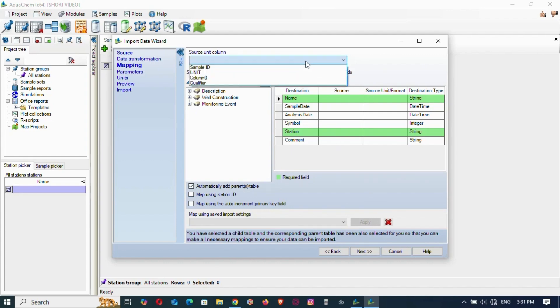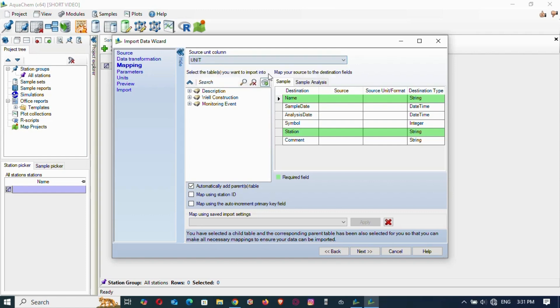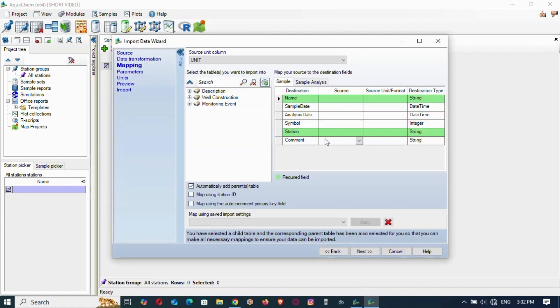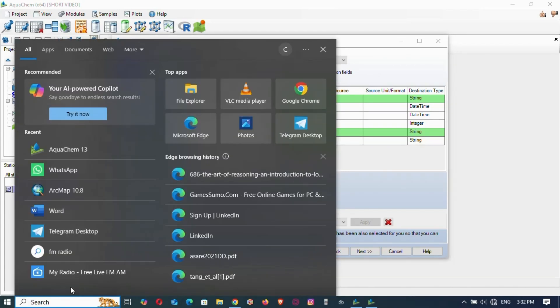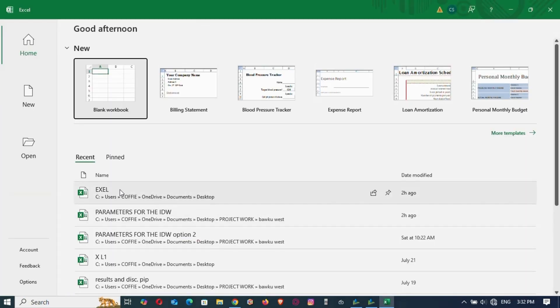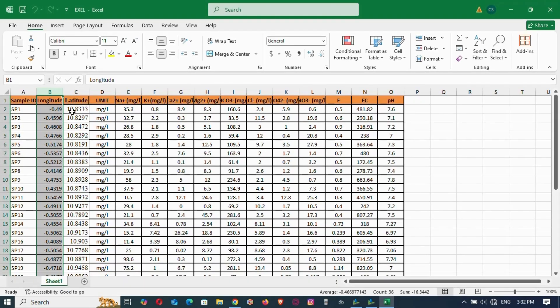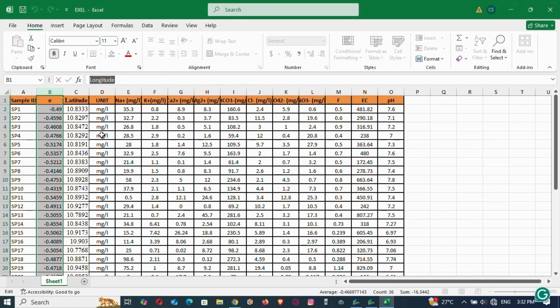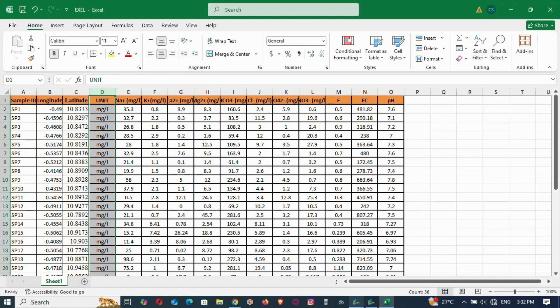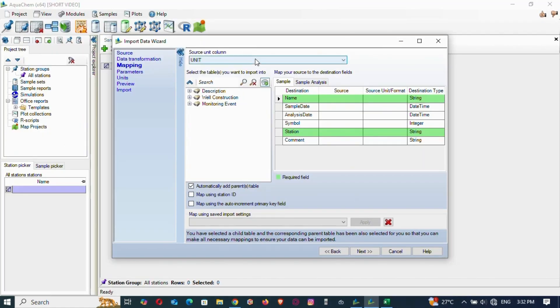Now it asks for the units source. The units are placed in a 'units' column in the Excel file — make sure the Excel file is closed or it won't work. This is the data I'm using; you can see the units are in that column, so I'm choosing 'units' as the source of the unit column.